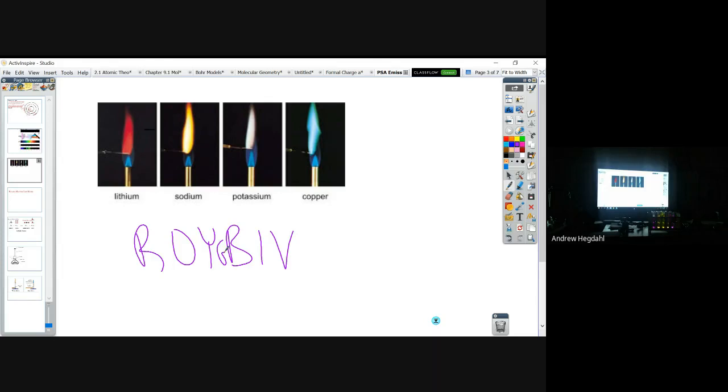All right, so if I shine a red light on here, you're like, is something supposed to happen? No, nothing really happens. It's pretty boring. So now I'm going to use a green laser. I don't really get a change there. Oh, okay. So this is called fluorescence. We get something to glow. This would be like using a black light. Maybe a little bit there, but it's not really strong. And then, oh, that one's pretty bright.